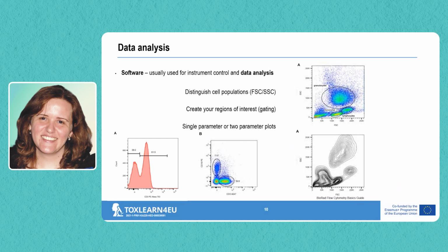Any of that can be here. And you will see peaks, and these will correspond to your populations. For example, if I had side scatter here, for this sample, I would have basically two populations, as you see here. So I would see a lower complexity population and a higher complexity population, okay?